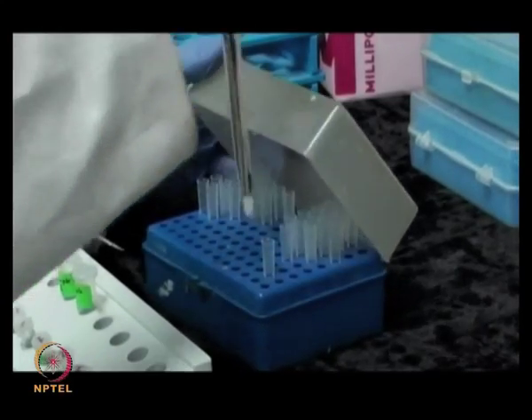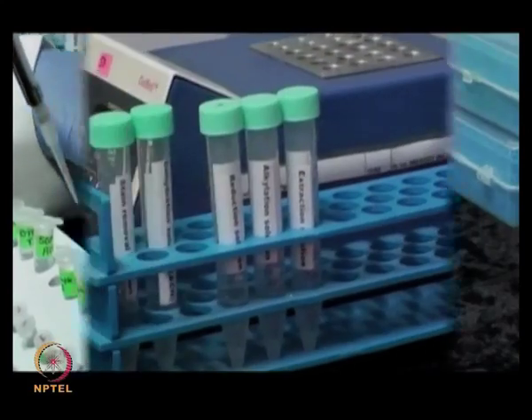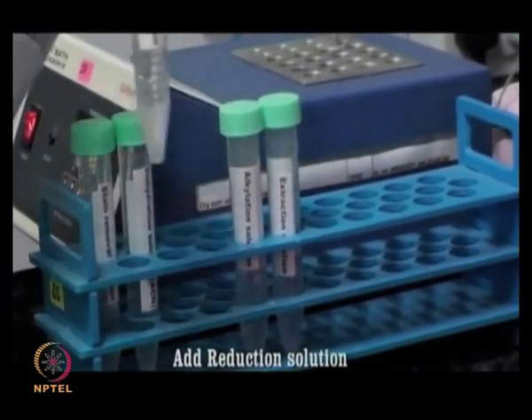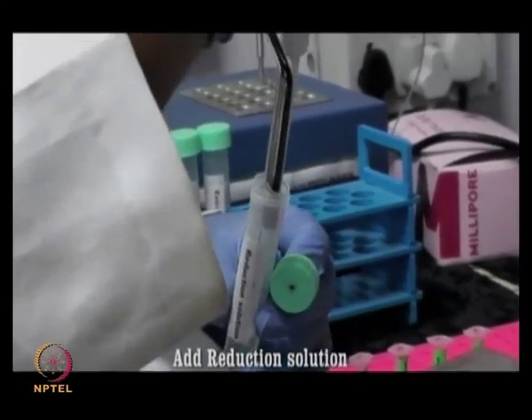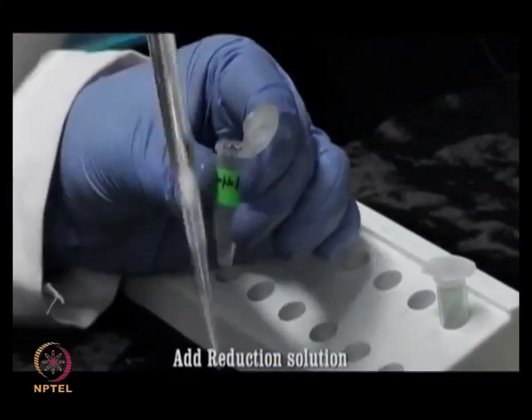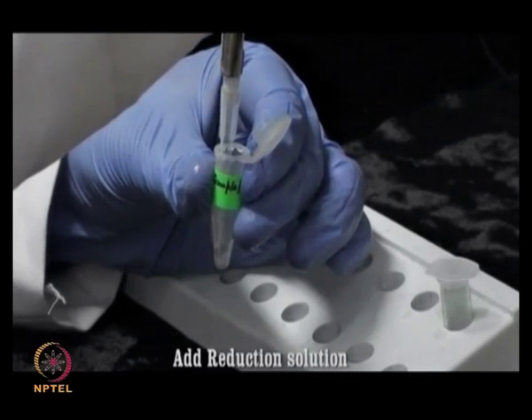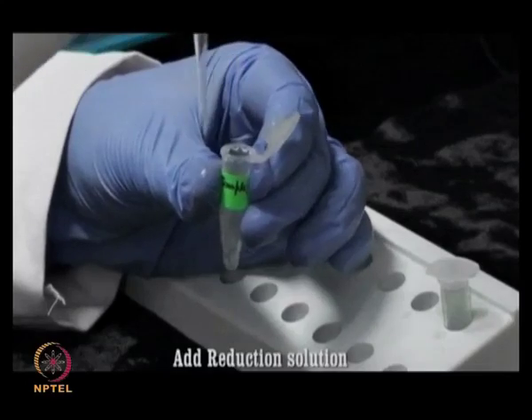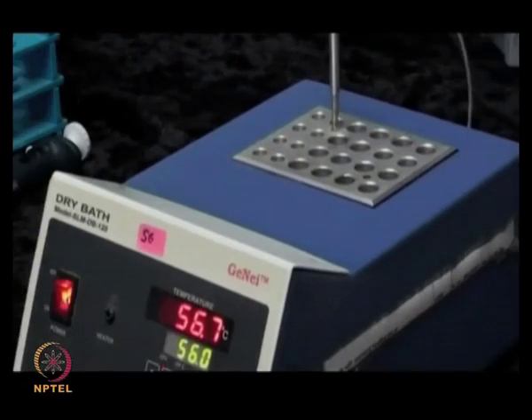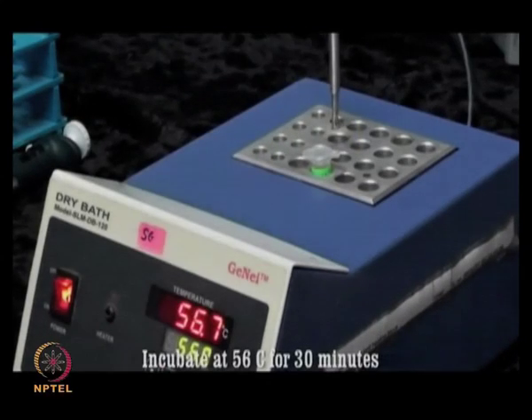After removing the solution completely, add reduction solution. Add 30 to 50 microliter of reduction solution to completely cover the gel pieces. Incubate it for 30 minutes at 56 degrees centigrade.